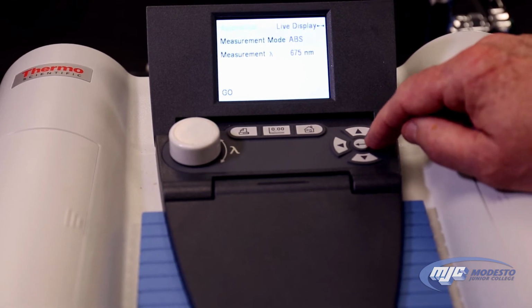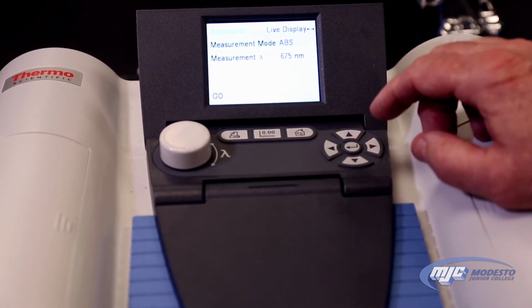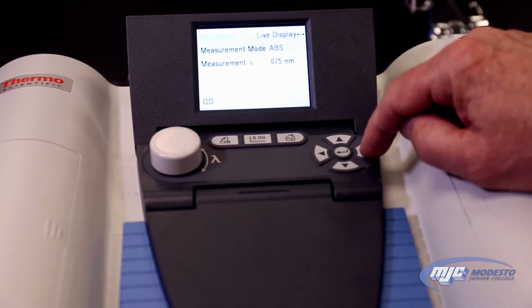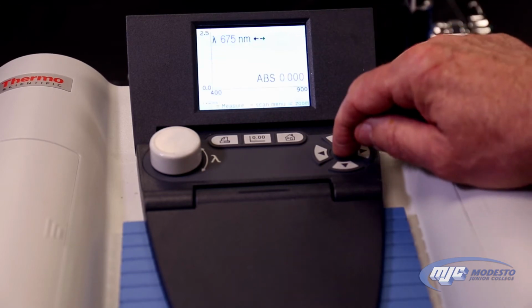And now, okay, the first thing we have to do is find the Lambda Max, the wavelengths of maximum absorbance for both cobalt and copper. So we arrow over here until up here where it says live display. We want that to say scan. So scan, once it's there, we press enter.